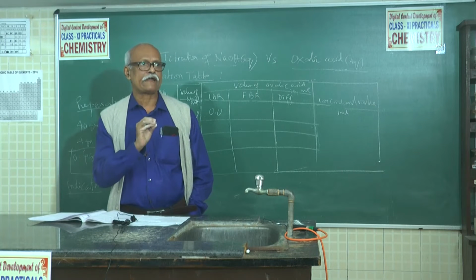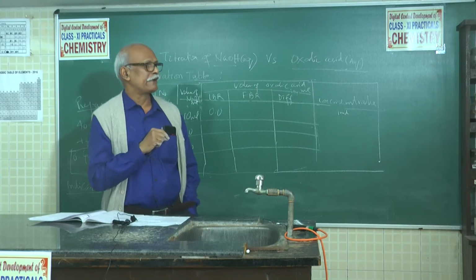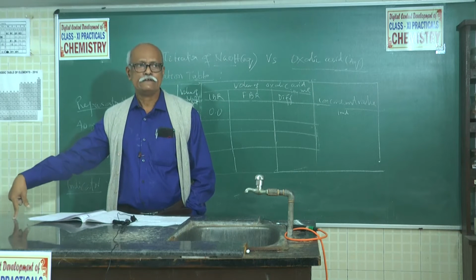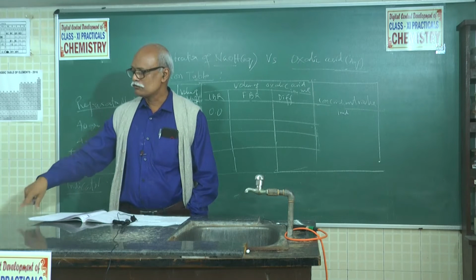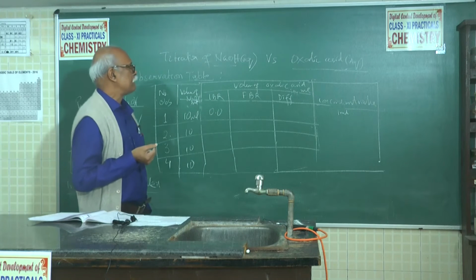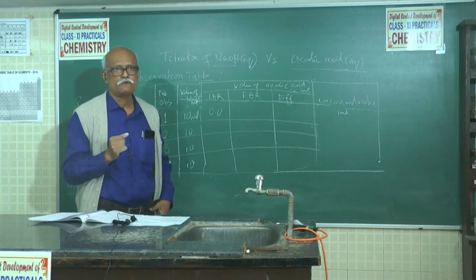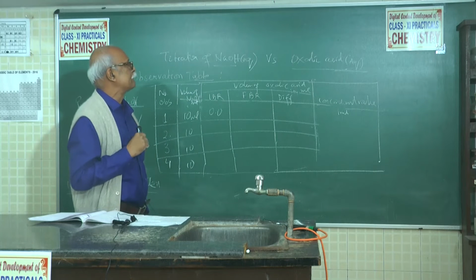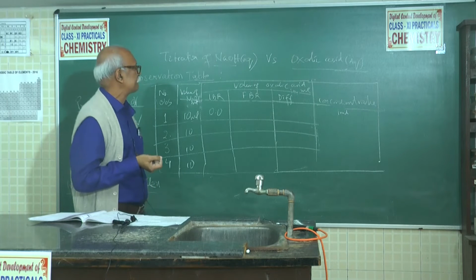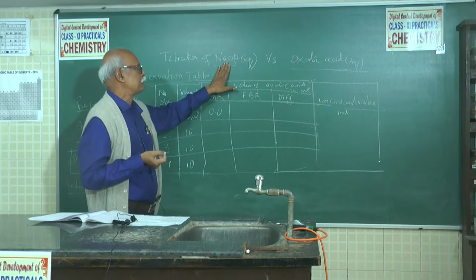So sodium hydroxide cannot be titrated against hydrochloric acid. Here we can titrate against oxalic acid, because we have prepared the standard oxalic acid some time before. Understand? Oxalic acid is also a primary standard, and with reference to oxalic acid we are preparing a decinormal or N/20 solution, and titrating oxalic acid versus sodium hydroxide. Sodium hydroxide is not a primary standard.